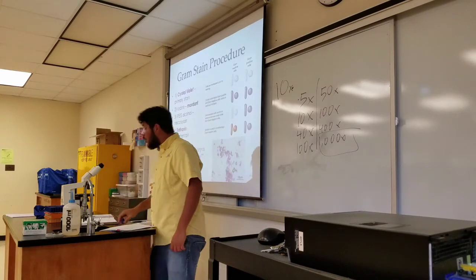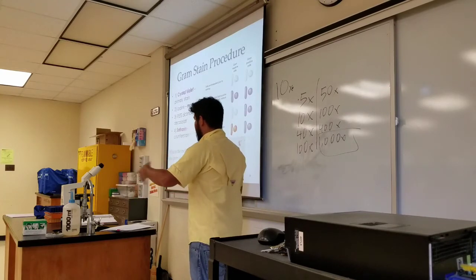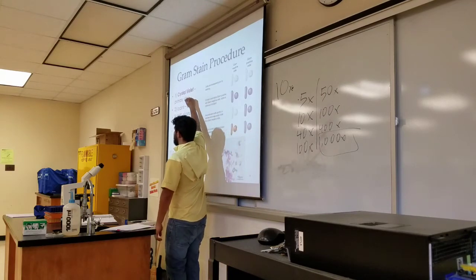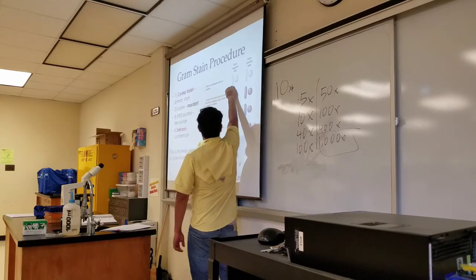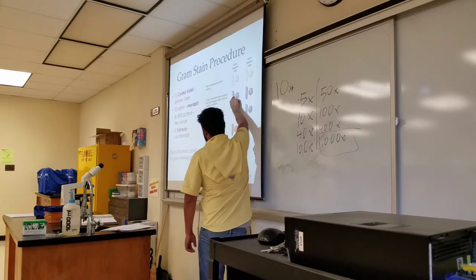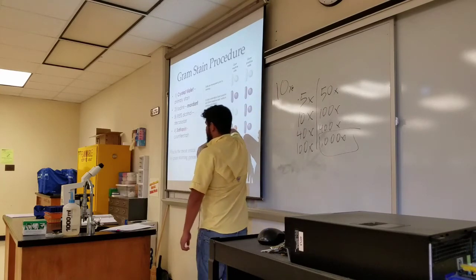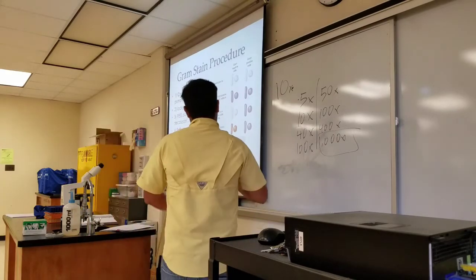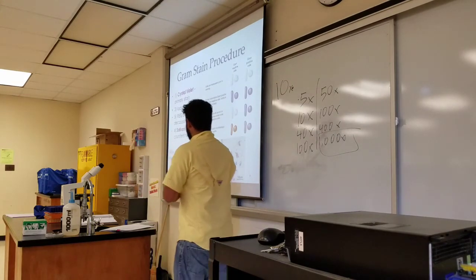And I will go over the procedure, but to let you know why this procedure works and how we can detect that difference in the cell wall using this. What we do is a direct staining with crystal violet. So if we start with our bacteria and do our smear, we will dye our bacteria, both the gram-positive and gram-negative, with crystal violet. Then we are going to add iodine. Iodine is a mordant, which basically will help fix the crystal violet onto the bacterial cell wall.